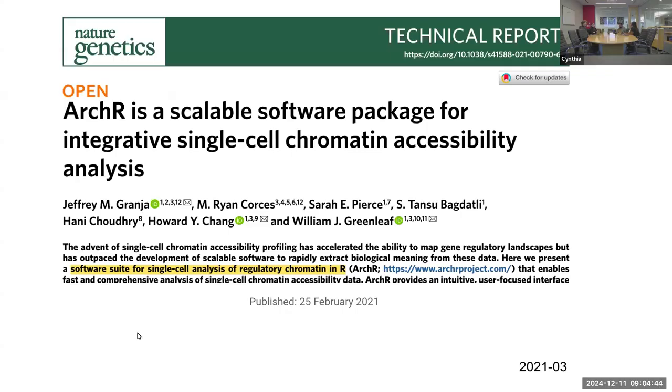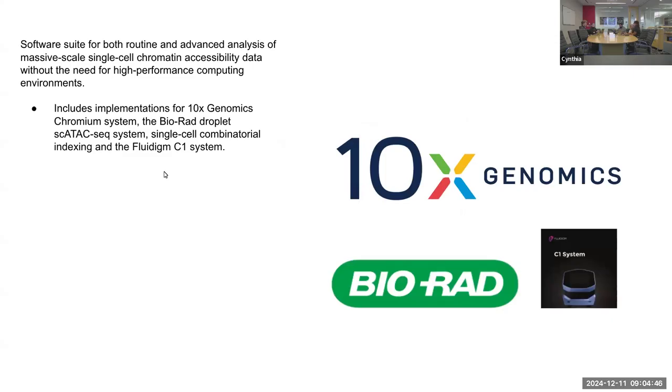I would like to start by saying that this is a suite, a collection of software that can do routine analysis, but also advanced analysis on massive scale single cell chromatin accessibility data without the need for a high performance computing environment. This is very important because many of the tools that I have seen to do this kind of analysis require a lot of resources.